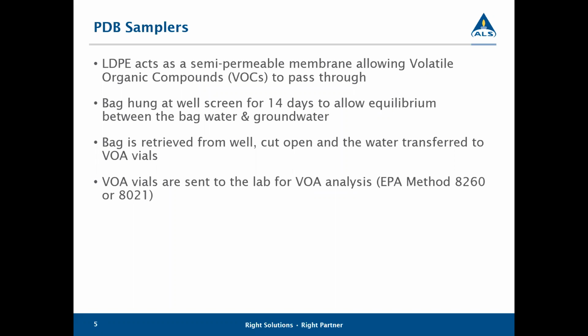So from that aspect, they can be virtually left deployed indefinitely, and by the time you get out there to collect that sample, because there is constant equilibrium being reached through that membrane, you will have a representative sample of the well when you collect that sample.